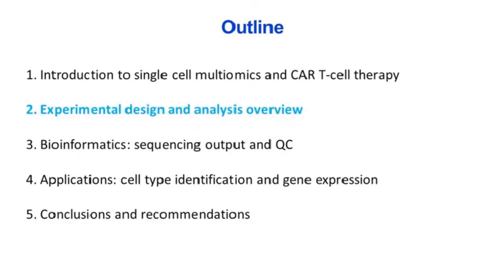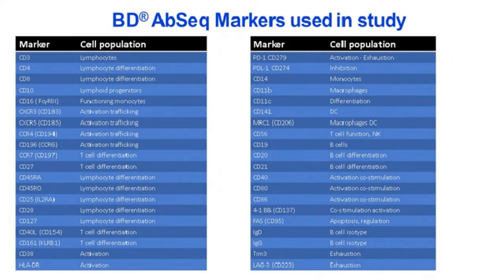So that was a summary of the single-cell multiomics and CAR T-cell therapy, just to give a background. The next thing I'm going to show you now is what we do with these experiments, with this technology, in the context of CAR T-cell. So I'm going to show you the experimental design and the overview plan that we have performed.